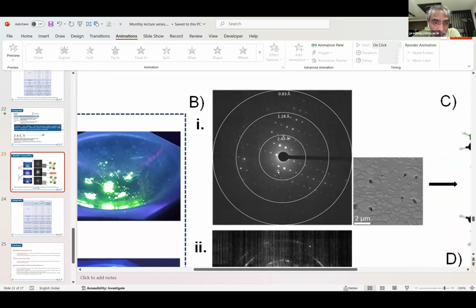Below that, there is one more line, a series of lines. Can you go to the right side of that line? If you go down, we are very close to that line. First circle, second circle. In between the first circle and second circle, there is a bright spot, then a weak spot, and two weak spots. Similarly, if you start looking at the bottom line, it is not a continuous gradient for the spot intensity. What is the reason for this?